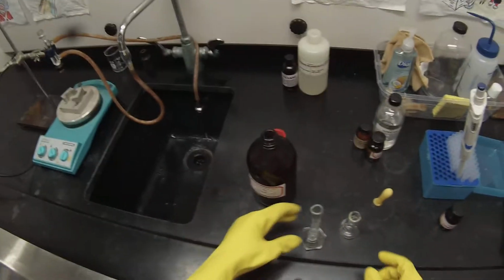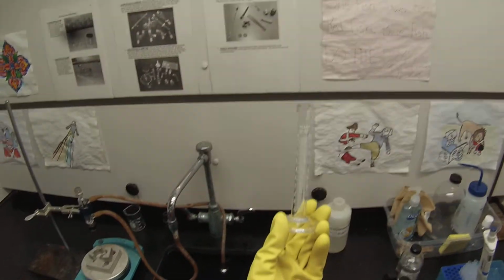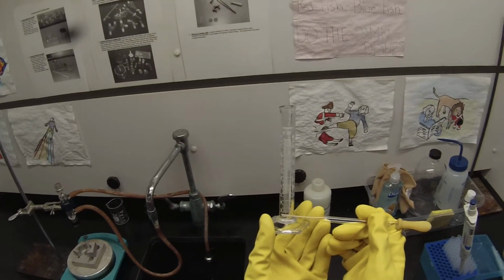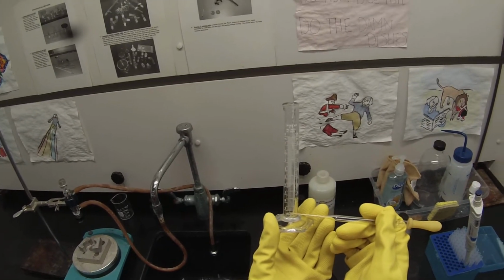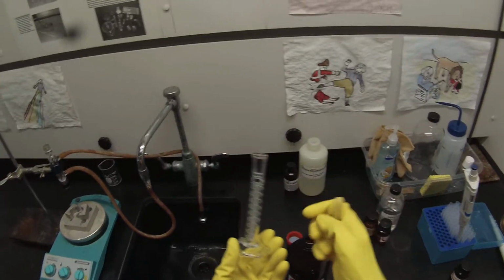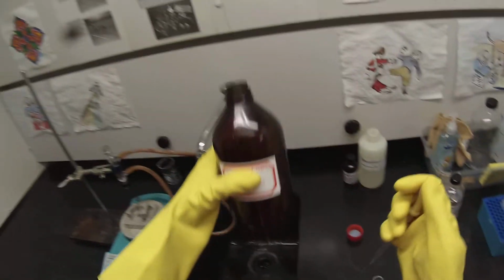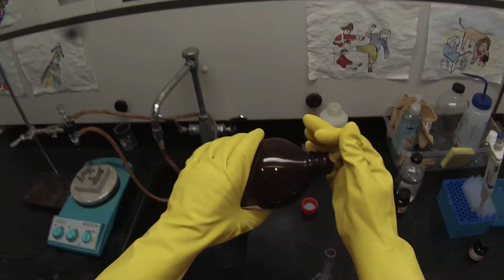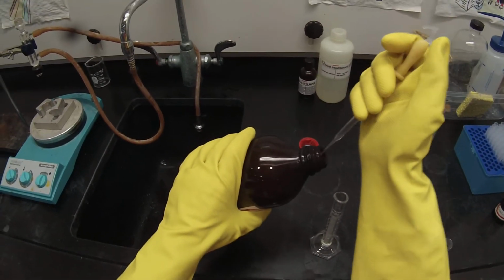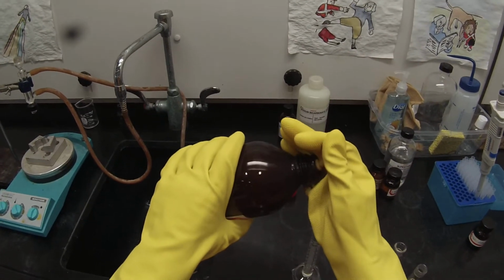You can see the concentrated acids are fuming a little bit when they reach the moist air. So we need 2.36 milliliters, which is about 2.4. But I'm going to be setting up 3 reactions today using this concentrated acid mixture. So I'm going to go ahead and measure all of it, 3 times 2.4, or 7.2 milliliters. That way I won't have to keep measuring it out. And I'm going to use a pipette to dispense it so I don't spill it in the attempt to pour it. And then I'll use that same pipette to transfer it to the vial.